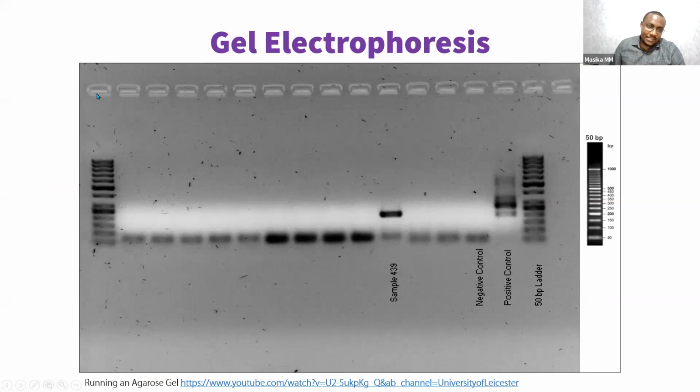So you see here, these are the wells, and these wells are made using a comb, because the gel is usually liquid. It's very liquid initially, but as it cools down, it hardens. Not as hard as rock, but as hard as, those of you who have eaten halwa or gelatin, yes. So in these wells, you put your sample.